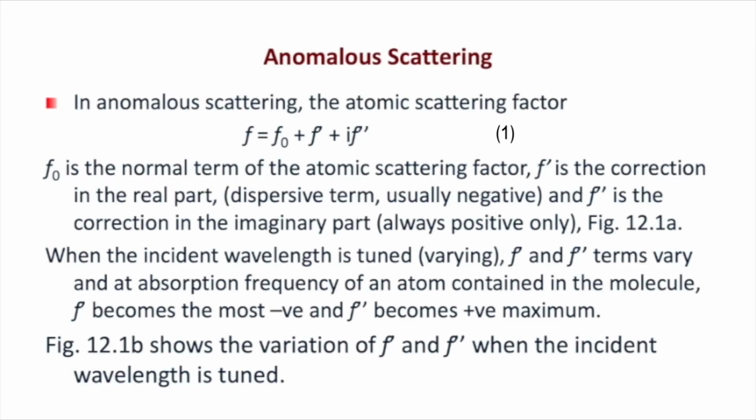This denotes the difference between structure factors FHKL at one wavelength and at another wavelength due to the contribution of the real part correction F prime. So which we will deal with in detail later. Don't bother. So one is known as Bijvoet difference or anomalous difference Patterson when you use the anomalous differences due to anomalous scattering. And second is again anomalous scattering only. The real part contribution makes the dispersive difference Patterson.